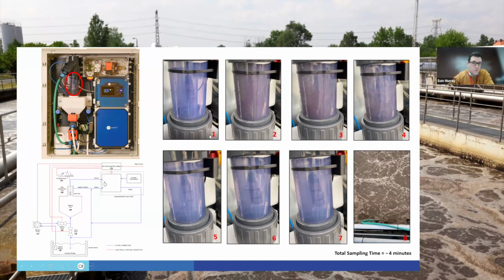So in picture 1 here, you can see that the intake filter of the analyzer is located in the internal tube. That's just air at the moment. So the sample is drawn into the system. The activated sludge then is filled into the external tube, and there's an air bleed valve located within the fluidics, and that's closed at this point. So the internal tube, in which the intake filter of the system is located, is separated from the aeration tank sample because the air bleed valve is closed.